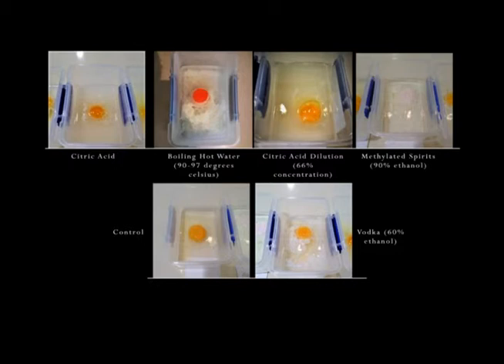Future improvements to this practical could reflect a more accurate representation of stomach pH, where hydrochloric acid is utilized rather than citric acid. This would give experimental results which are better suited to commenting upon the effect of pH on protein denaturation in the body. Another implementation that would benefit the experiment would be multiple trials of each substance testing, as well as a broader range of dilutions of each substance to identify the minimum concentration of that substance which would cause protein denaturation.